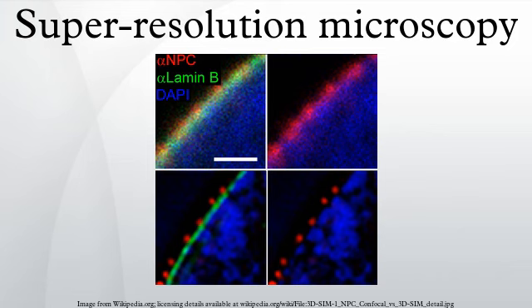SPDMPHYMOD microscopy uses fluorescent molecules that are emitting the same spectral light frequency but with different spectral signatures based on the flashing characteristics. By combining 2000 images of the same cell, it is possible, using laser optical precision measurements, to record localization images with significantly improved optical resolution. Standard fluorescent dyes already successfully used with the SPDMPHYMOD technology are GFP, RFP, YFP, Alexa 488, Alexa 568, Alexa 647, Cy2, Cy3, ATTO 488 and fluorescein.